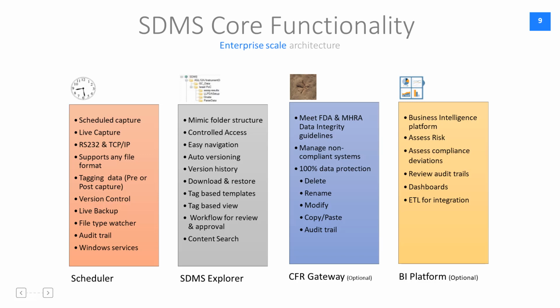There is a controlled access to the Explorer for viewing data. That means only authorized persons can view the data inside the software at any point in time. Only when you provide appropriate user rights, you will be able to view your data.